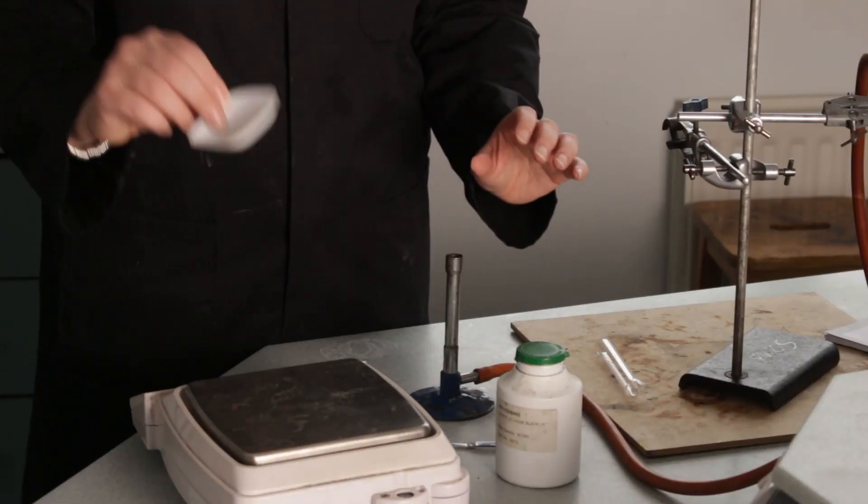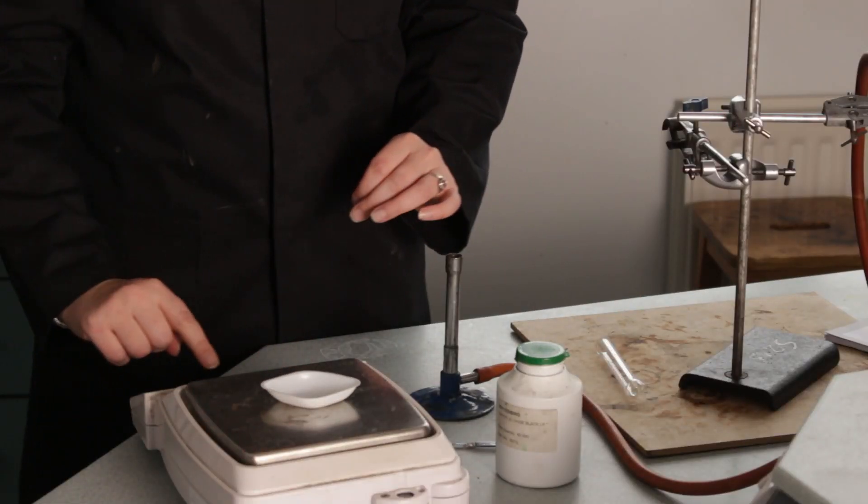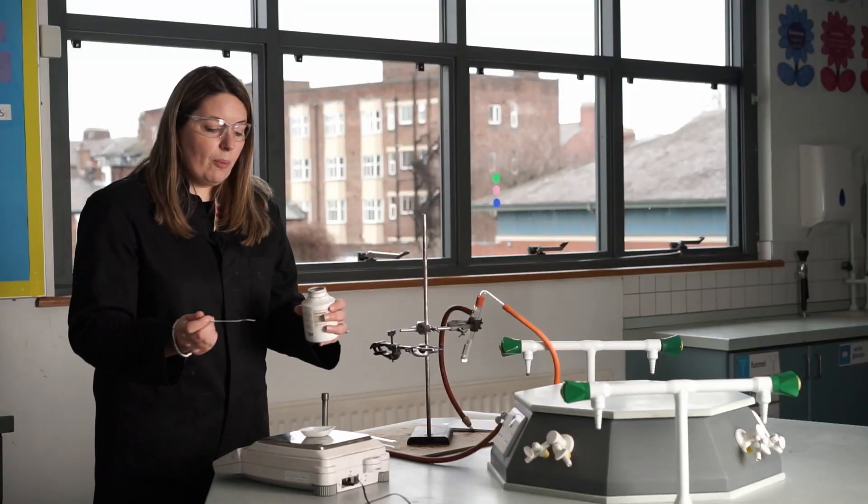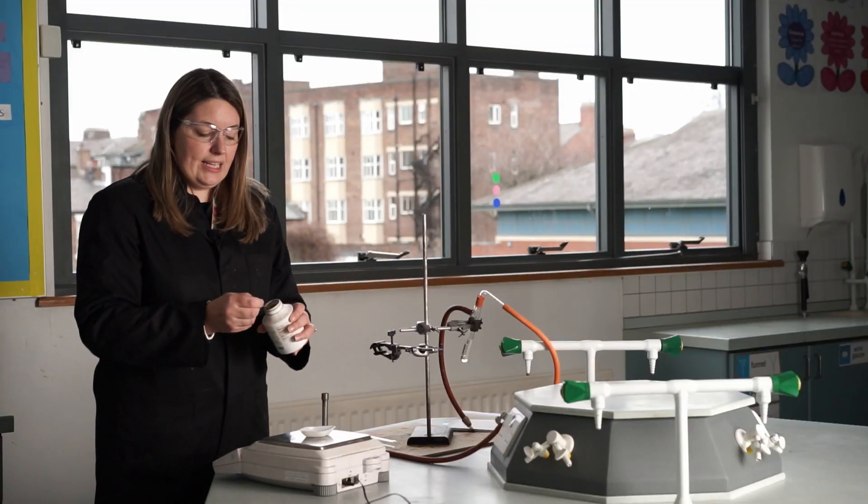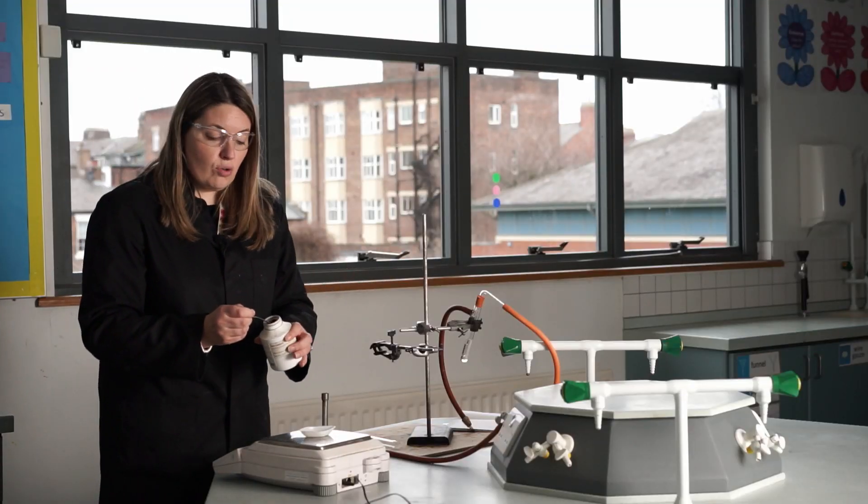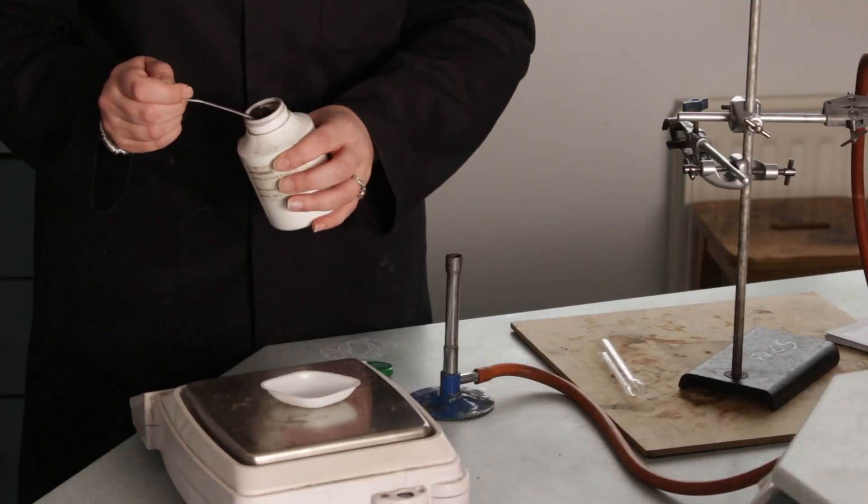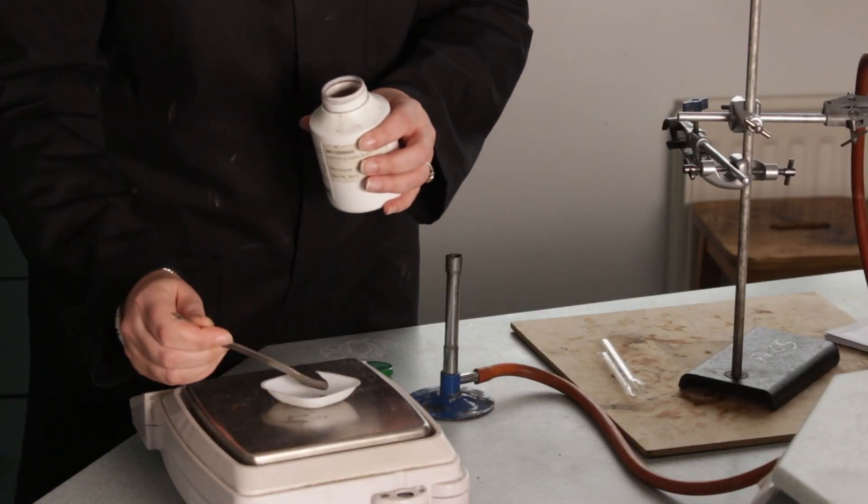I'm going to put that to one side. I'm then going to take a weighing boat, zero my balance, take some copper oxide, which is a black solid, and we're going to weigh out two grams. So I've got a weighing boat on a balance and I'm going to weigh out two grams.